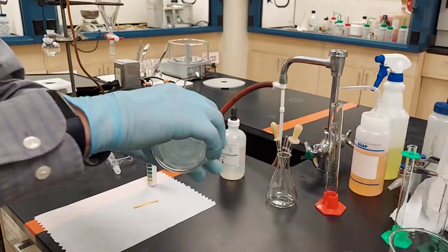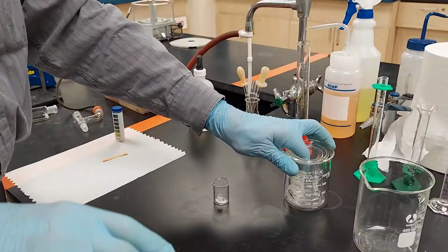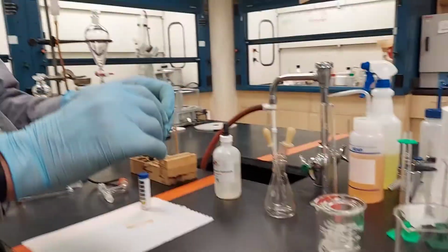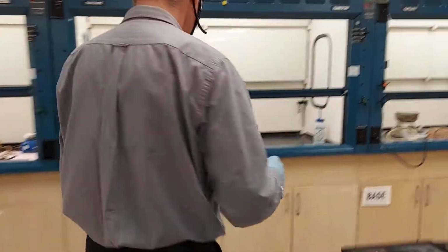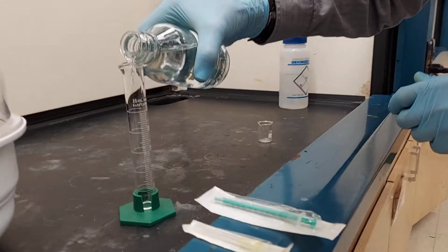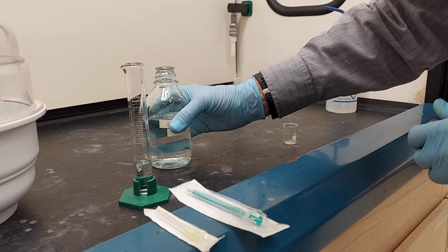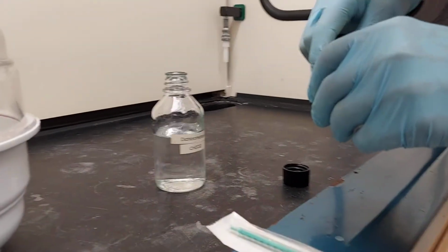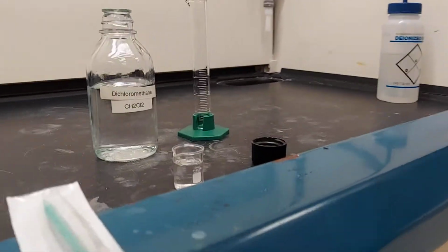And what does it say we're going to add to this beaker? Anhydrous methylene chloride. Is it for the ferrocene? I believe it is. Right. So how much methylene chloride? 9 ml. So we're going to do 9 mLs. Pretty close, a little closer to 8, but it's solvent. So are we that concerned with solvent? Not usually. So we have 9 mLs of dichloromethane.